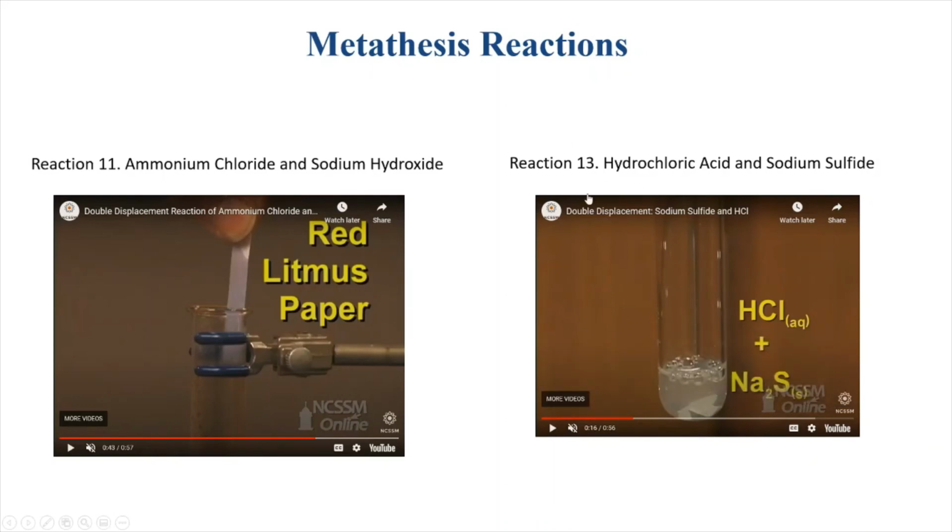Now remember, this is the one that we said that you need to do in the hood. And the reason for that is because if you were to do this out on the bench, you wouldn't even have to waft it, you would just smell it. You would get a very, very strong odor of rotten eggs. So definitely some form of a gas is coming off of this, and that gas has a strong rotten egg odor.